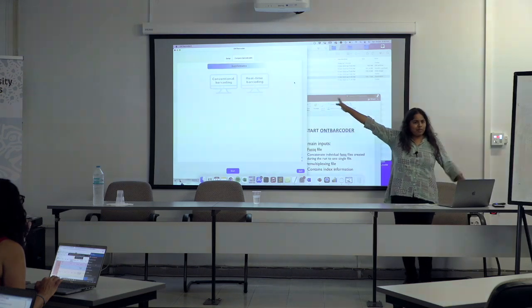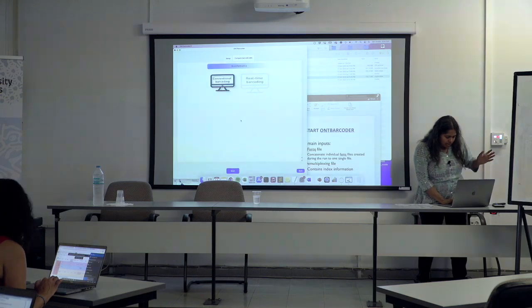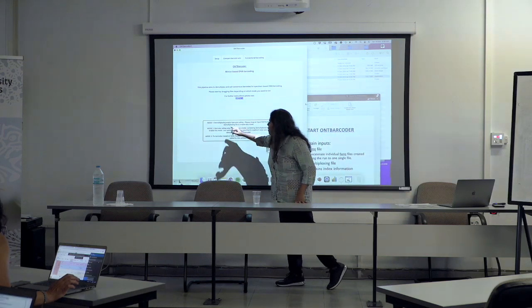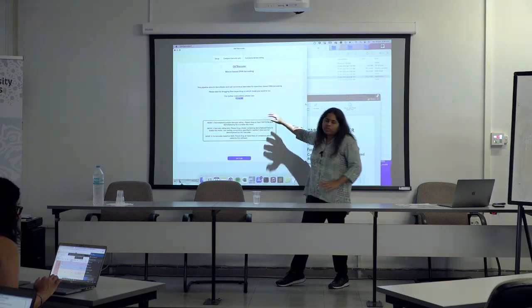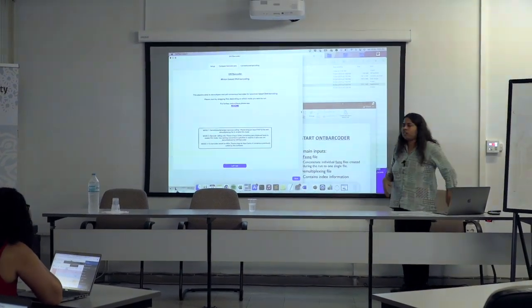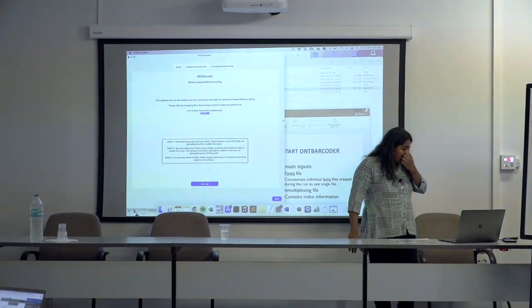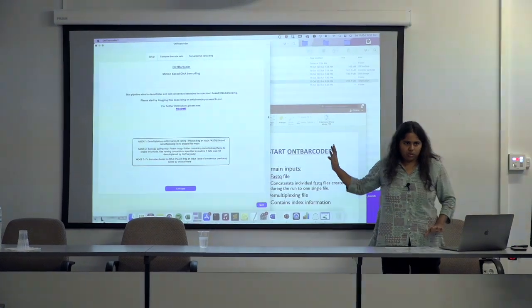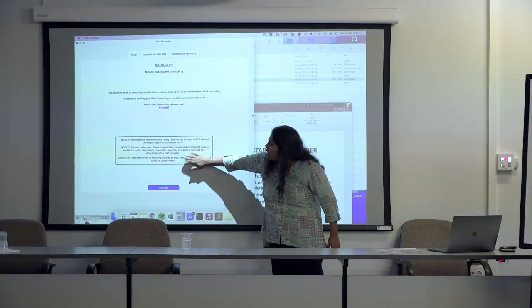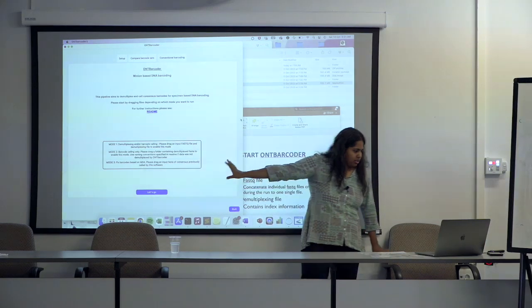Okay, so has everyone managed to open it? The process is rather simple. You can just select and start. There are 3 modes in the software. Mode 1 works when you start from raw FastQ through to demultiplexing. You can also feed in demultiplexed files in the second mode, so in case you want to use another demultiplexer, you just have some formatting requirements that need to be followed. The third is for some output modification and error corrections, if you just want to perform error corrections.